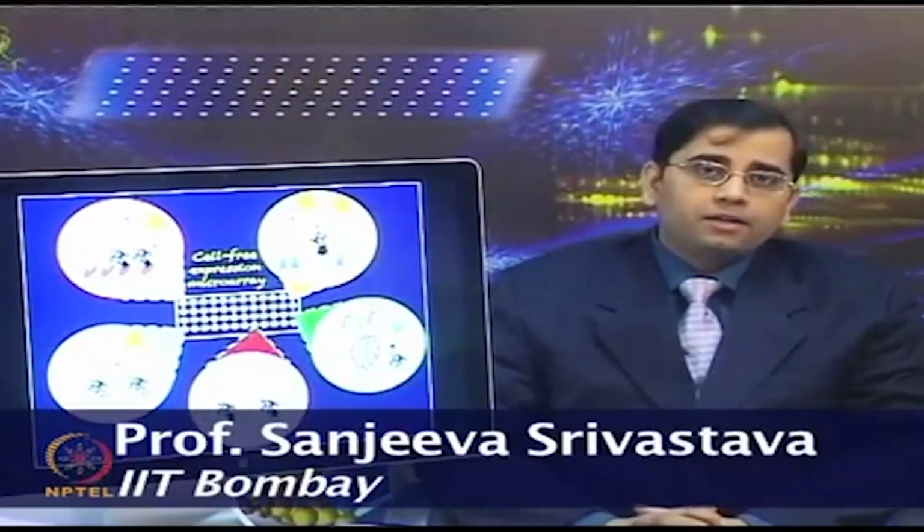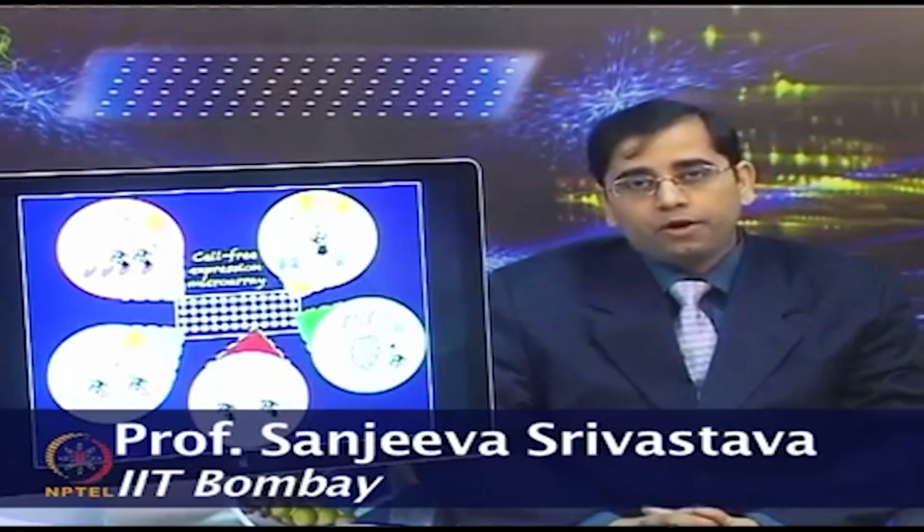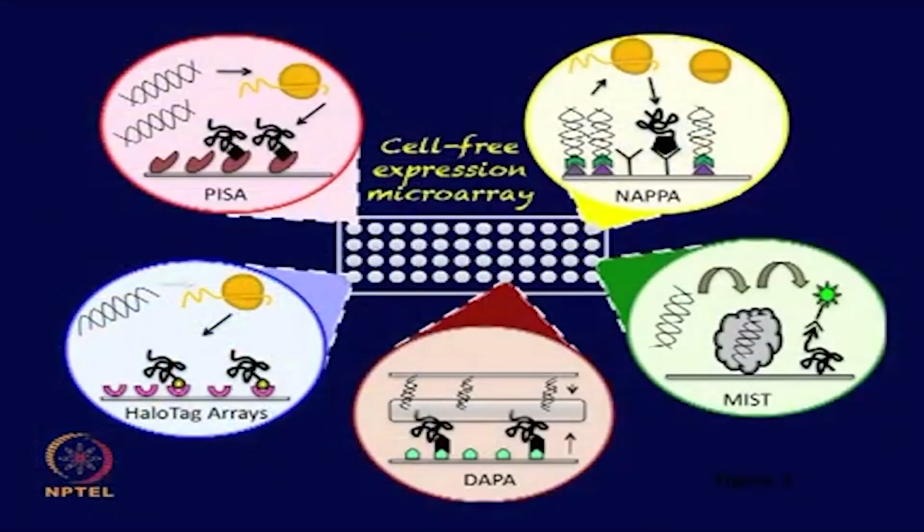In the previous lecture, we discussed how different types of cell-free expression systems can be employed to generate protein microarrays. We discussed different types of approaches, including protein in situ arrays, nucleic acid programmable protein arrays, multiple spotting techniques, halo tag arrays, as well as DNA array to protein arrays.